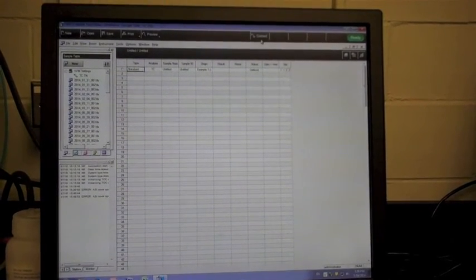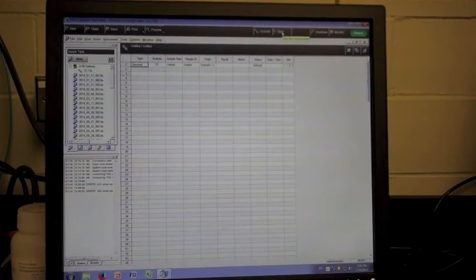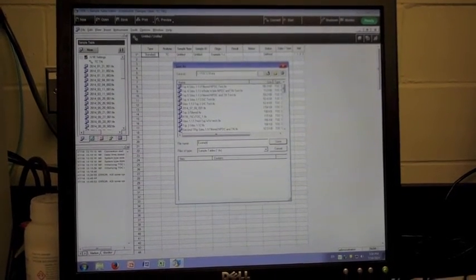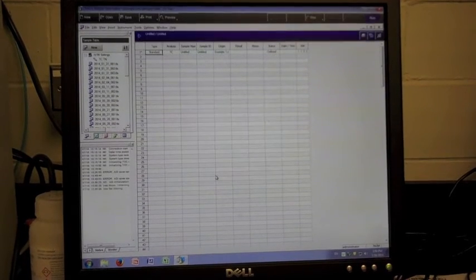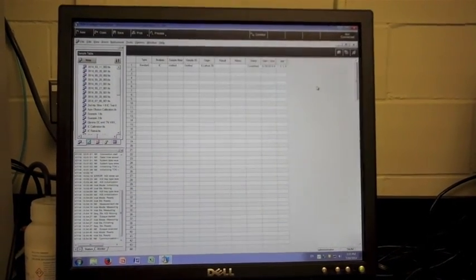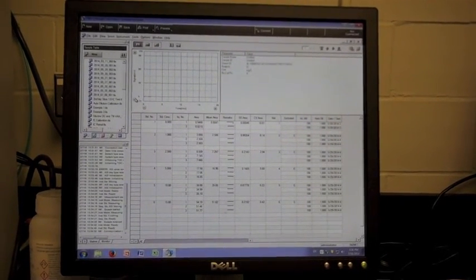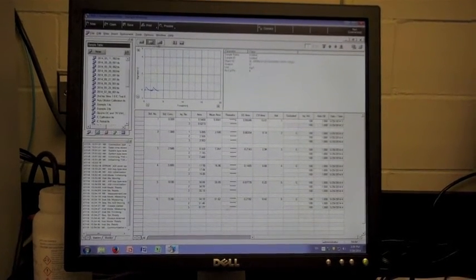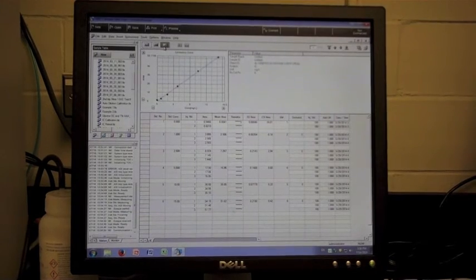Once all steps associated with running a calibration are completed, reconnect the machine via the connect option on the right side of the top bar. Once reconnected, select the start option directly to the right of connect. After selecting this, create a name to save the calibration under, then select an action for the machine once the run is over — the shutdown instrument option is recommended so the furnace is not left running for an extended period. To view results from the calibration run, select the file under the sample tables. You will see multiple readings for each calibration point; the machine automatically averages readings and excludes outliers. Selecting the third graph option shows the calibration curve — a good linear graph means the calibration ran smoothly and may be used for sample analysis.